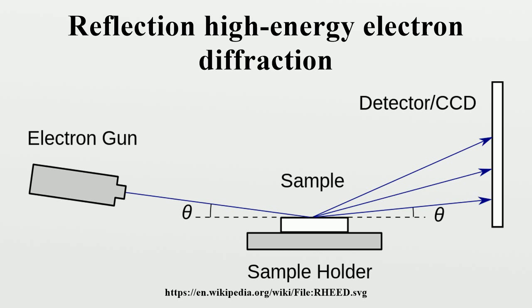The azimuthal angle affects the geometry and intensity of RHEED patterns. The azimuthal angle is the angle at which the incident electrons intersect the ordered crystal lattice on the surface of the sample. Most RHEED systems are equipped with a sample holder that can rotate the crystal around an axis perpendicular to the sample surface.